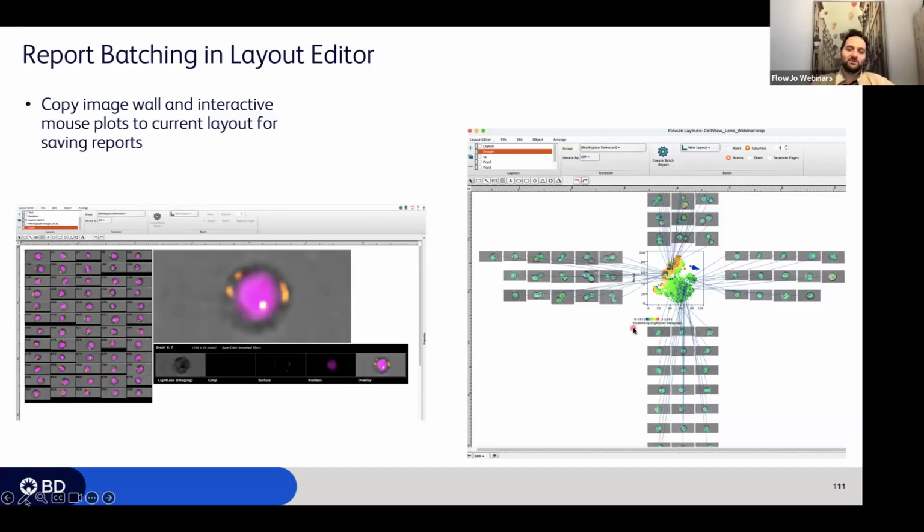And then, of course, the one on the right, you might see here, it's a nice addition we have. There is a shortcut where you can select your population and visualize, if you have an image set that we're going to explain later, or a specific cluster, those images back onto your graphical window, and it will directly connect each image with a specific dot or specific event you selected there.